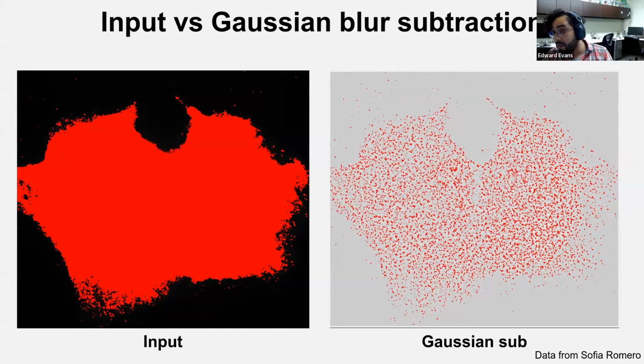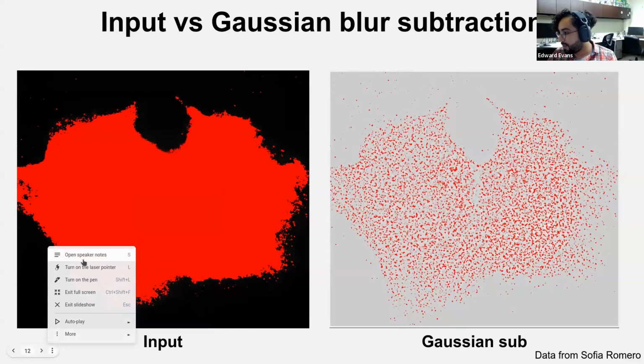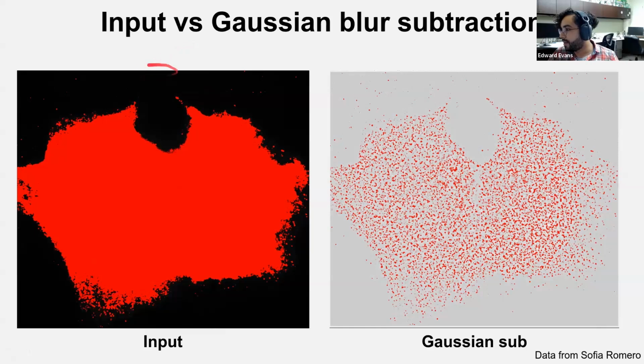So if I look at the input image that I did not do anything with, right? And I apply the threshold, and I believe this is the triangle threshold, which works in my experience pretty well with puncta. You can see I'm getting the entire thing. There's no way I'm going to find any individual puncta in this image here. Oops, sorry. I should get my cursor. There we go. So yeah, there's no way I can get anything here, right?